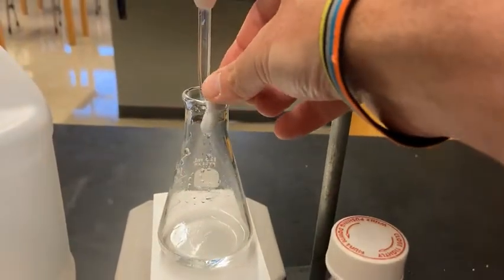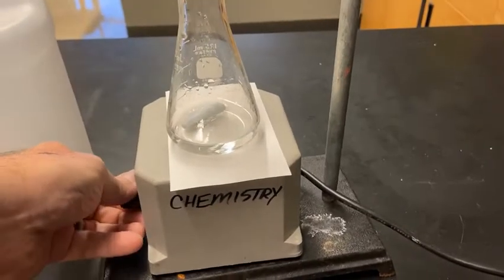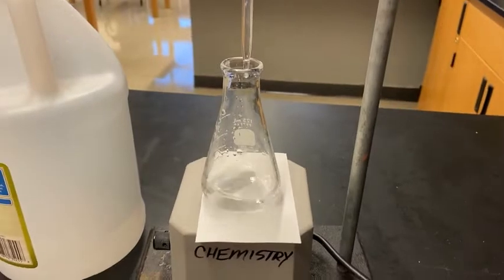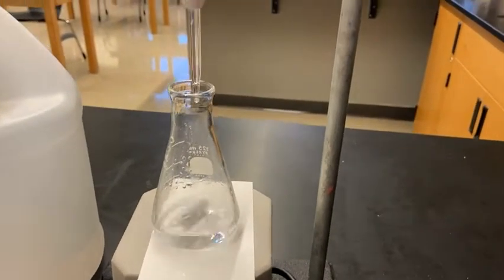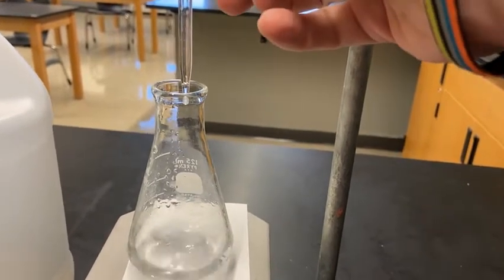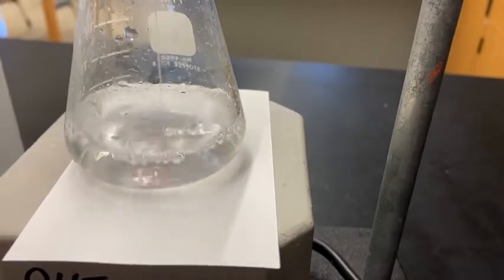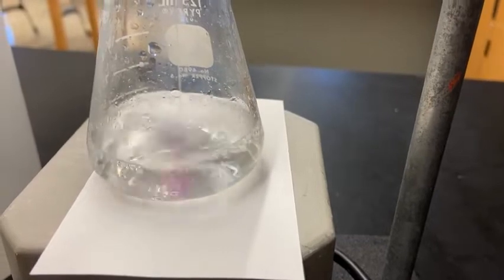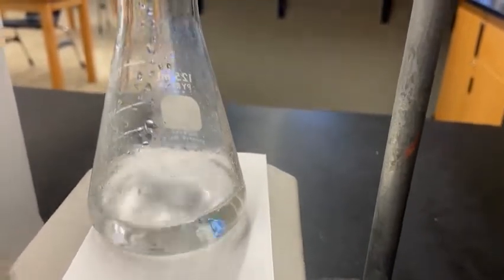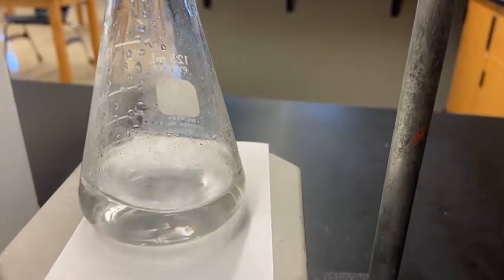Now we set up the titration. I'm putting in a magnetic stir bar so it stirs automatically while I work with one hand. I'll turn it on to get it stirring gently so the base mixes with the acid as it drops in. Now I'm going to use the stopcock to start adding the base into the acid. You can see a little bit of pink developing, but it disappears immediately. I'm going to keep adding base — right now there is more acid than base, so we still need to add more to reach the end point.